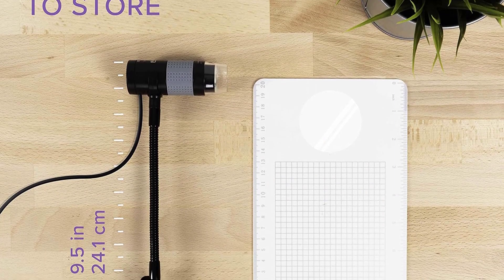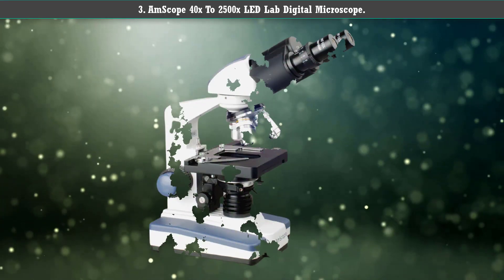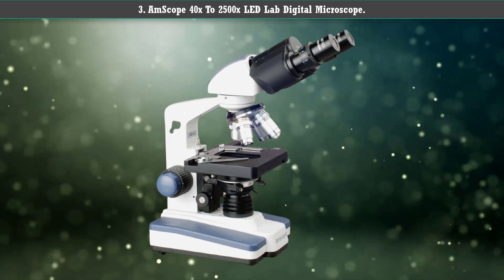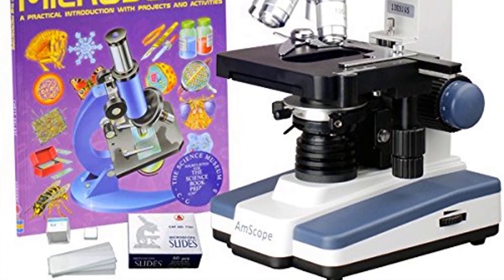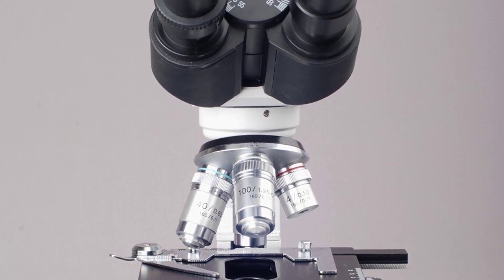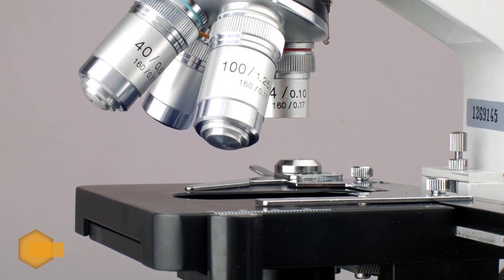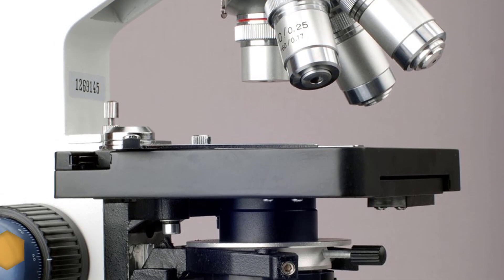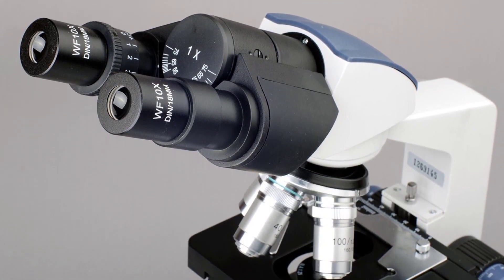This is a microscope that is great for classroom and field applications. Number 3: AmScope 40x to 2500x LED Lab Digital Microscope. This is a versatile microscope that can be used not only for home or casual use, but also for classroom teaching, clinical use, and laboratory applications, making it great for students, hobbyists, and professionals alike. This microscope has a high magnification range of 40x to 2500x.